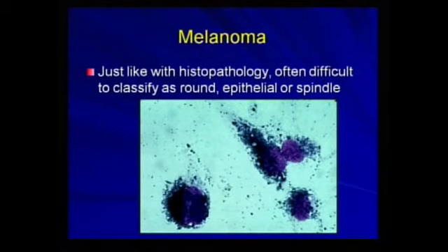In our diagnosis letter, we will comment on a particular location. So if the aspirate came from the oral cavity or the digit, we will mention that melanomas in these areas have a higher rate of malignancy. Occasionally you will get some melanocytic neoplasms that obviously have evidence of malignancy, mitotic activity or mitotic features, large nuclei, marked anisokaryosis.